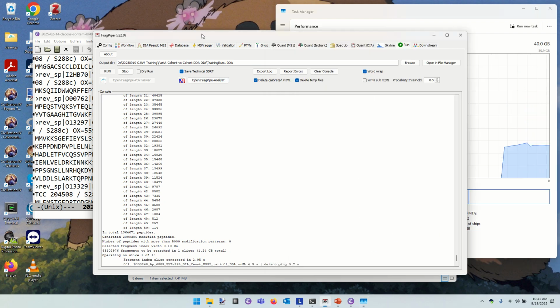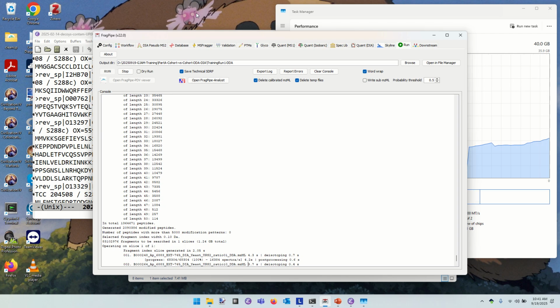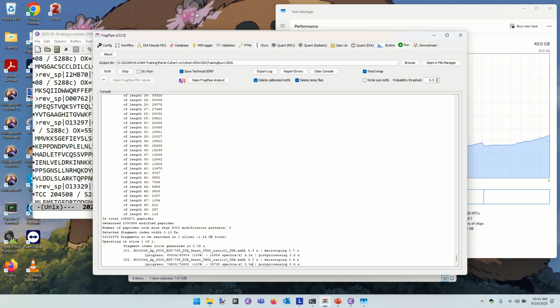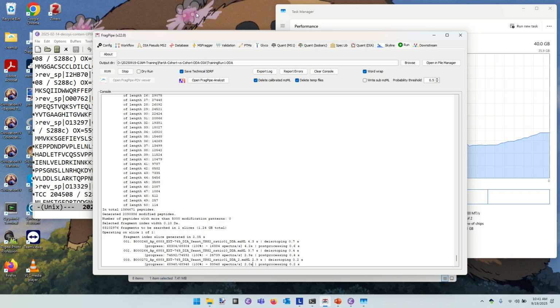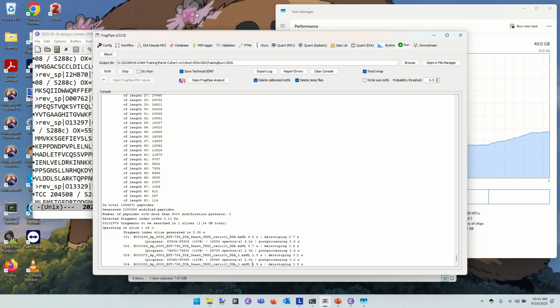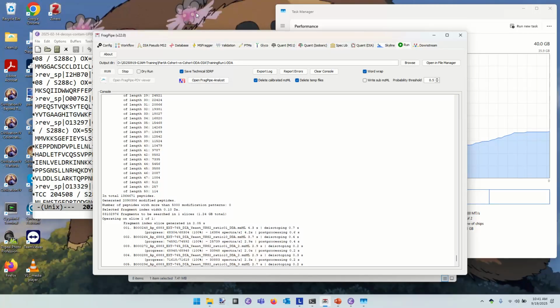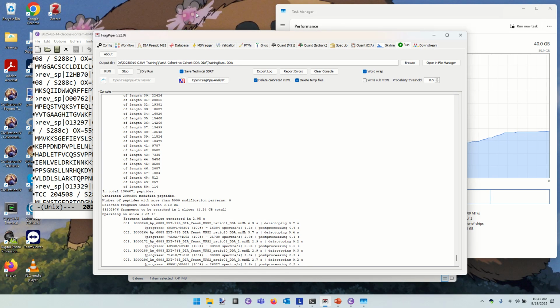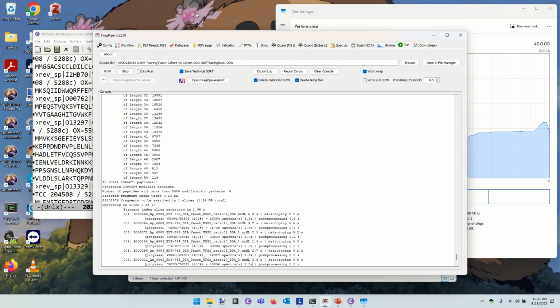All right. So we can see that it's definitely taking some CPU time as it does this first step, but probably for most ordinary laptops, the memory load is going to be the biggest issue. If you have a laptop with 4 gigs of RAM, this is going to be pretty painful in all likelihood. Is it behaving itself on 8 gigs? Click on the memory. Yeah, it's using 6.8 of 8 gigs. That's 7.8 even. That's a good life. We're making it forward. I got insufficient memory. Oh, okay. Very frequently, it's the web browser. Yes. If you have lots of tabs open in your web browser, that is going to be a problem.